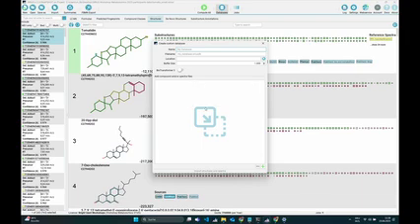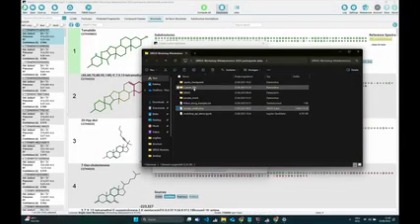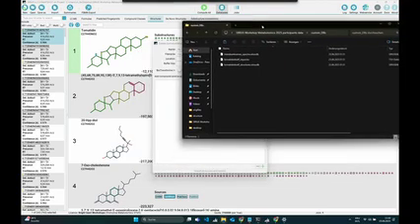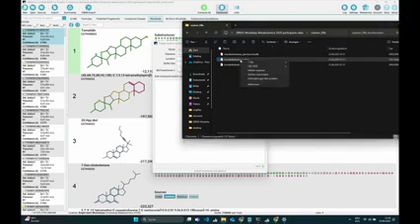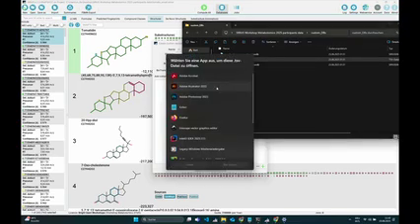And now you can just drag some structures in them or some spectra. So just to show one example, in the folder you have the subfolder called custom DBs. And if you open this, there will be, for example, this file named tomatidine biotransformer input tsv. And if you open this somewhere, I hope I can open it with some editor, yeah.